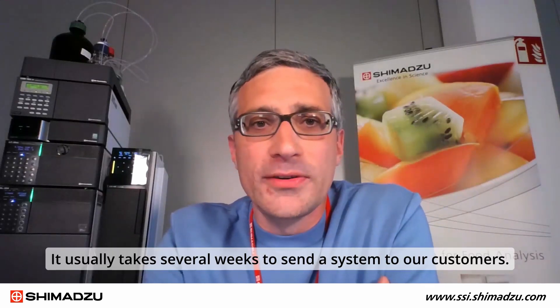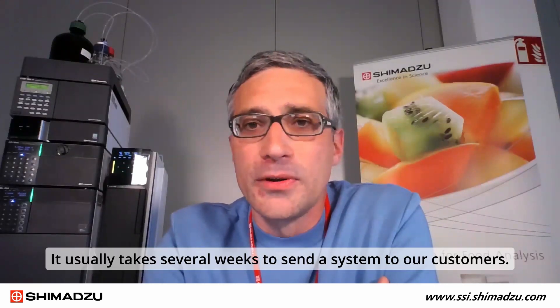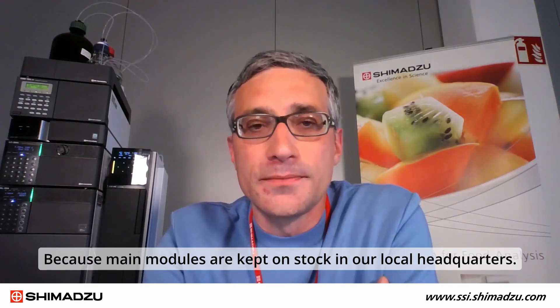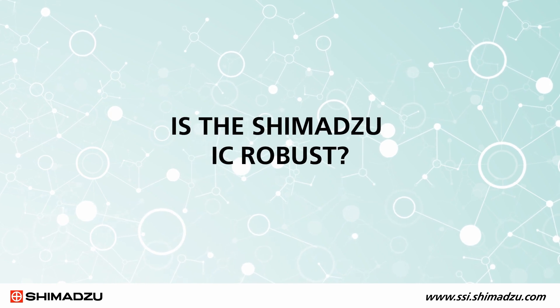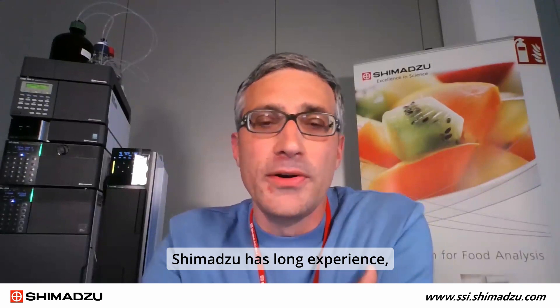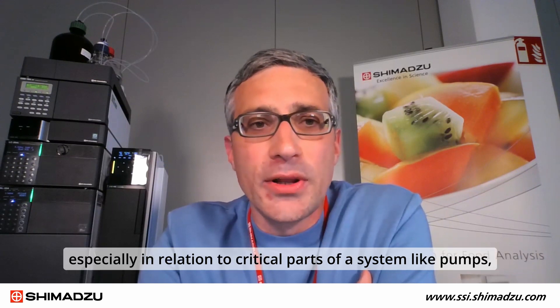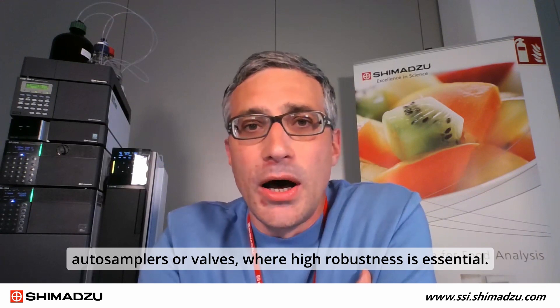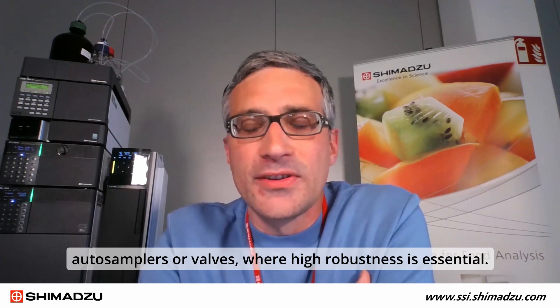It usually takes only several weeks to send a system to our customers, because main models are kept in stock at our local headquarters. Shimadzu has long experience — over 45 years — in production of HPLC instruments. As IC is based on HPLC technology, our ion chromatographs are very robust, especially in relation to critical parts of a system like pumps, auto samplers, or valves, where high robustness is essential.